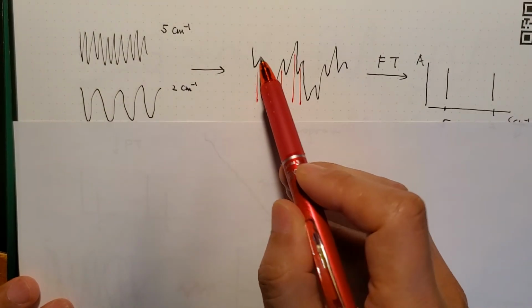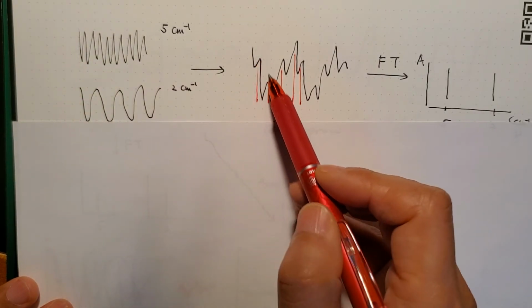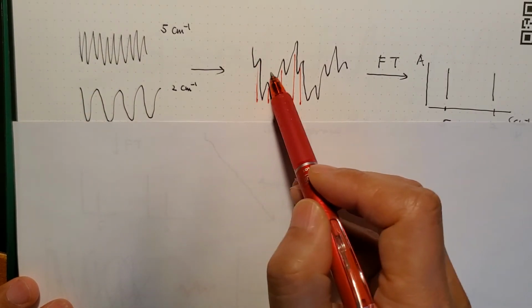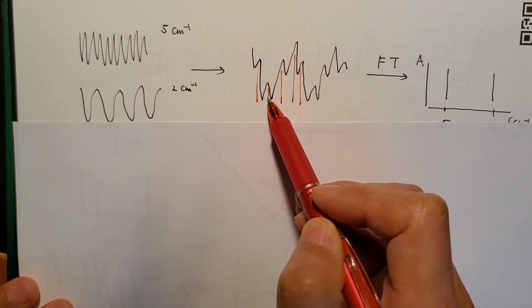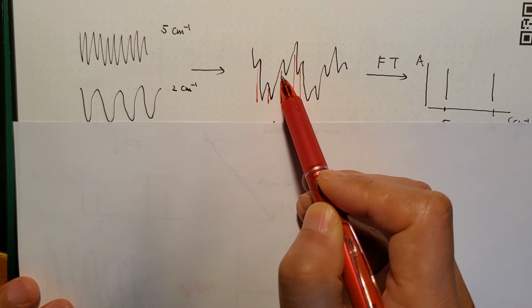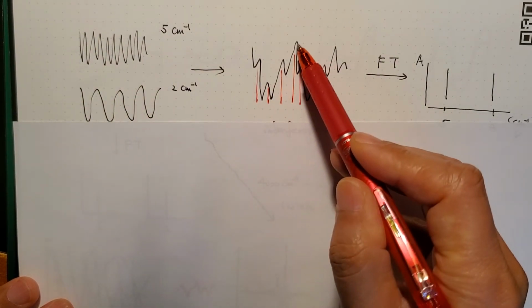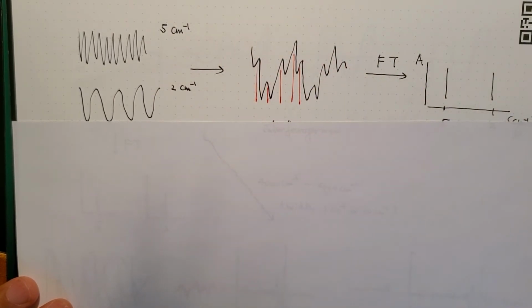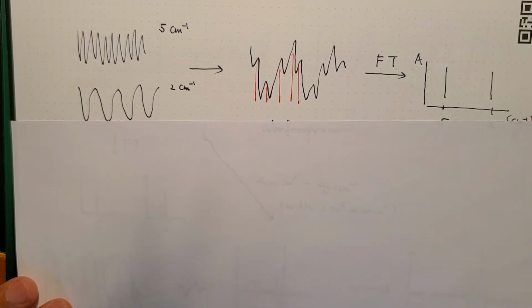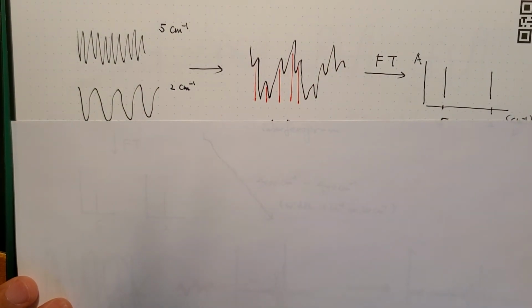So when the difference increases, the beginning is the same, but the difference is increasing this way, and then the intensity goes down dramatically, and then when it comes back up, they start to get the same phase, for example, start to go up. So it has another wave information coming from the difference of the phase of the 2 photons. And that's what the detector is detecting.